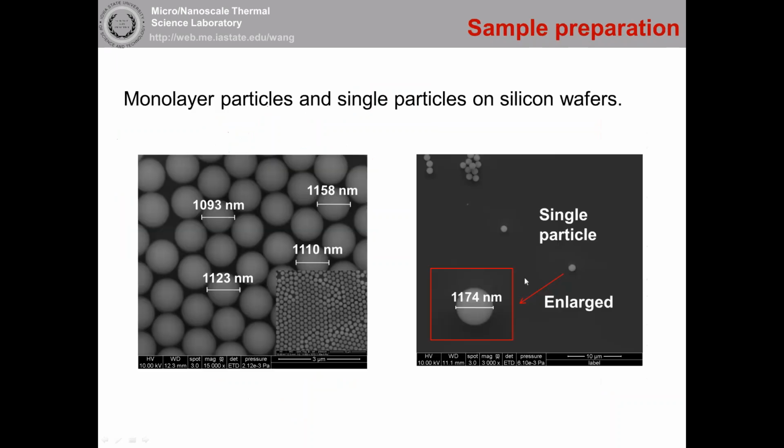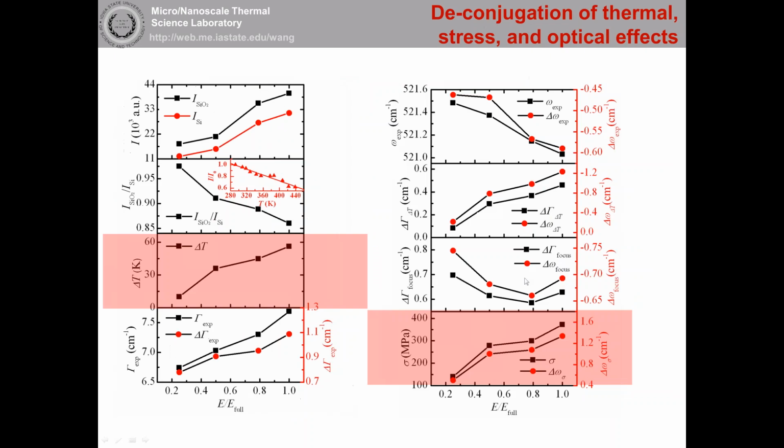It's very interesting. We can also determine the stress in the silicon surface. I think it's the first time people can do this kind of temperature and stress measurement in a tiny region, like 200 nanometers. Raman is probably one of very few techniques that can do that. Otherwise, it's so difficult.